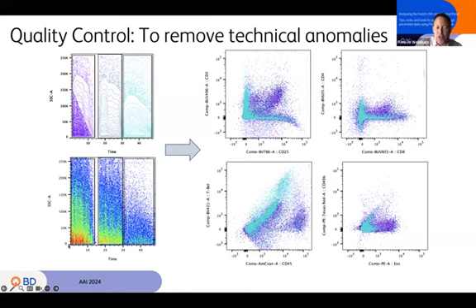And so what this is showing on the time axis is someone who was running the cytometer as fast as they possibly could. Had somewhere to go, somewhere to be. And they run into a clog right here. And then the clog breaks free and you have what might actually be a nice range of acquisition. And then here they noticed there was a clog. So they turn the flow all the way down. And so you've got three very distinct time ranges.